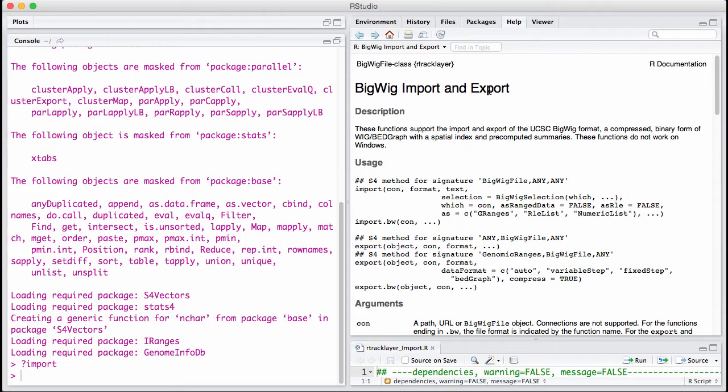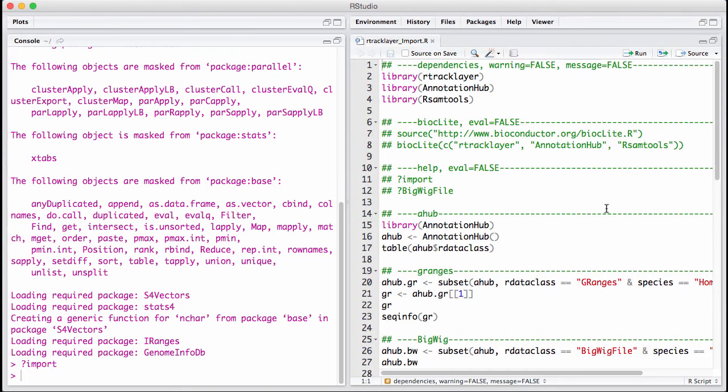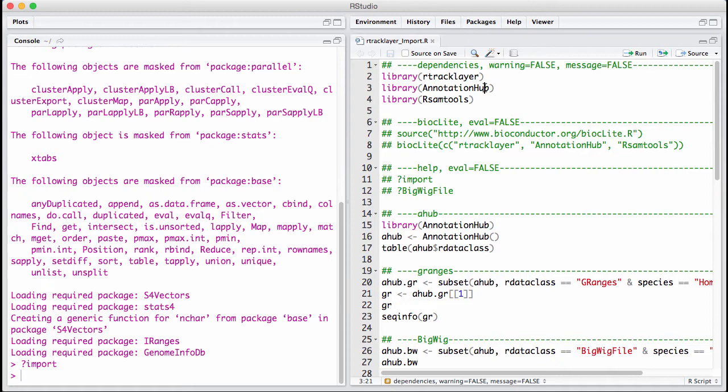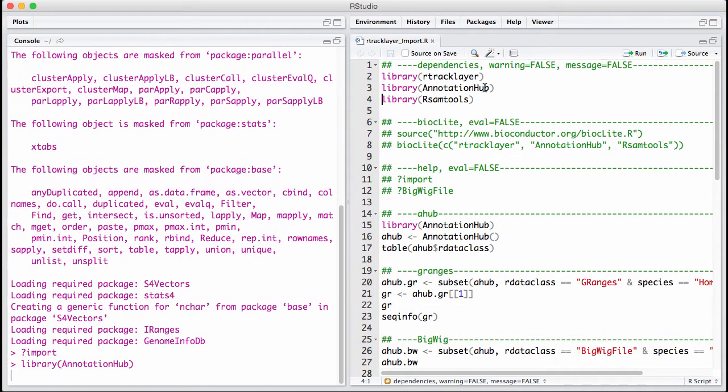Now let's get a BigWig file. The way we get a BigWig file is we're going to use AnnotationHub. We're going to return to AnnotationHub and set up a hub.